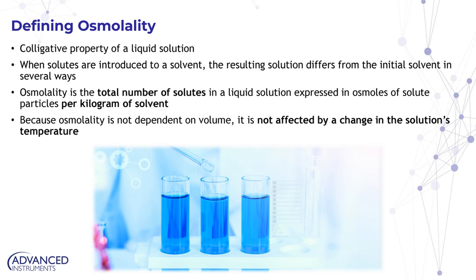The reason it's important to note this is because we're measuring it per mass, so osmolality is actually independent of the volume. It's not affected necessarily by the solution's temperature change, which drives a lot of the reasoning behind why this provides an orthogonal value to some of these applications that we'll be discussing. So I wanted to start off on that note so that we can better understand how osmolality fills gaps and provides a unique role throughout these processes.